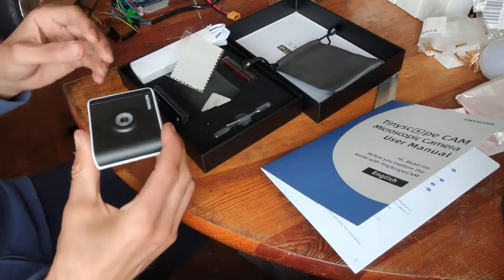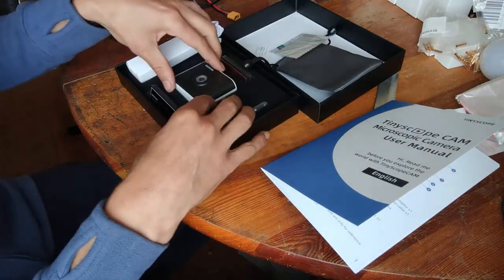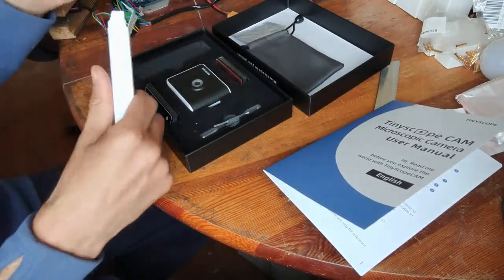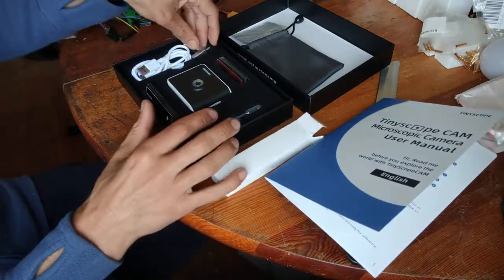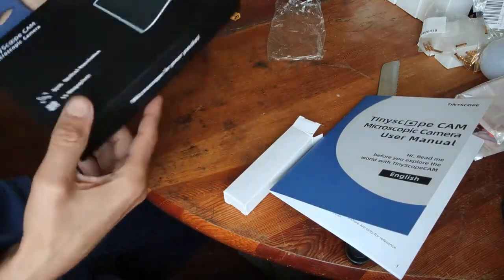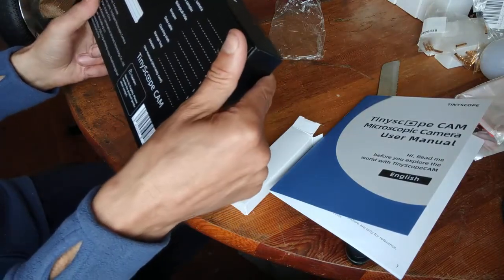Everyone who advertises 1000x magnification this way should know that's misleading. Especially on Kickstarter, you should have listened to what people found in the comment section. But please don't trash this product — the creator really did deliver it quickly and on time, so this is definitely a success.